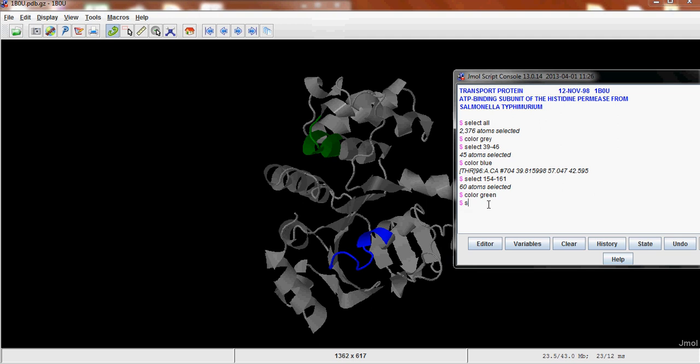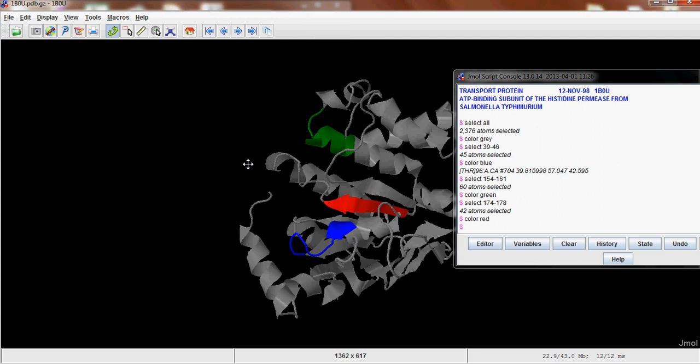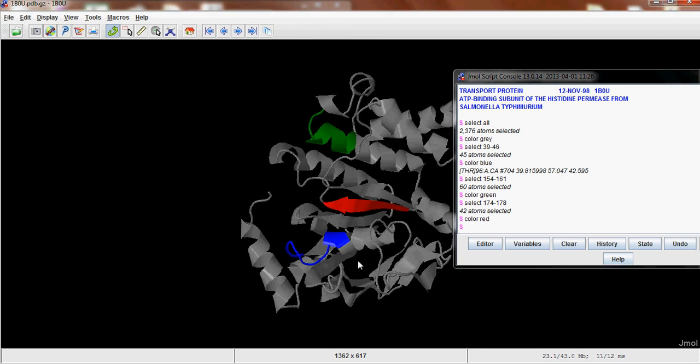And then the last one is 174 to 178. And we'll color that in red. So you can see you have your three motifs. You can comment on what kind of structure that they have.